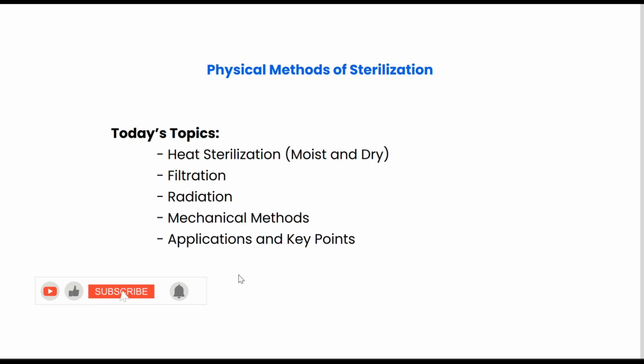In today's lecture, we will be covering the physical methods of sterilization, including heat sterilization like moist and dry heat, filtration, radiation, and mechanical methods. We will also discuss their principles, mechanisms, applications, and some important points you need to know. So let's get started.